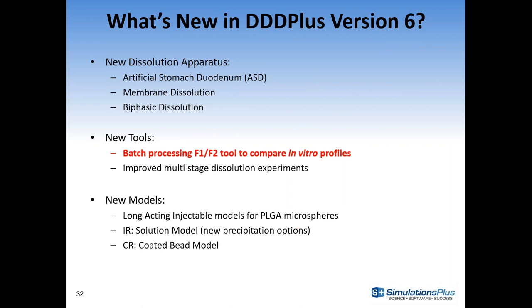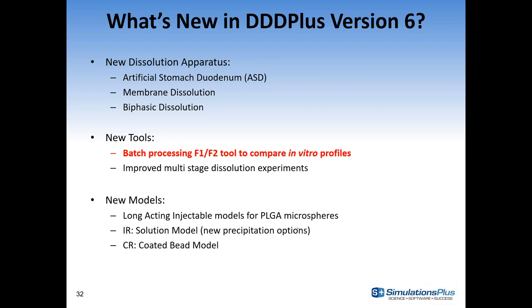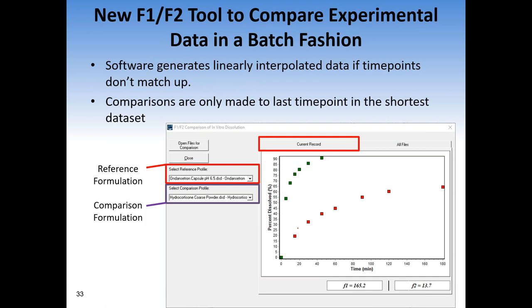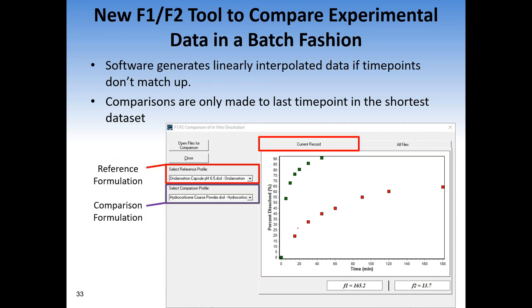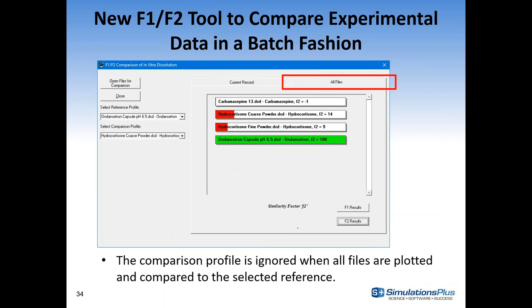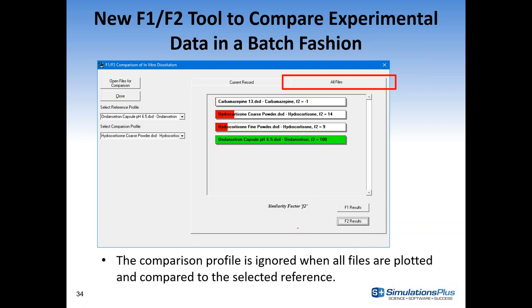Some new tools in DDD Plus include a new batch processing tool to compare in vitro profiles. You can load in a large number of DSD or in vitro dissolution files, select a reference profile and a comparison profile, and compare the F1 and F2 statistics. You can also compare against all files — for example, if you read in 50 files, select one as the reference and it will calculate F1 and F2 against all imported files, allowing quick comparisons of many in vitro experiments.